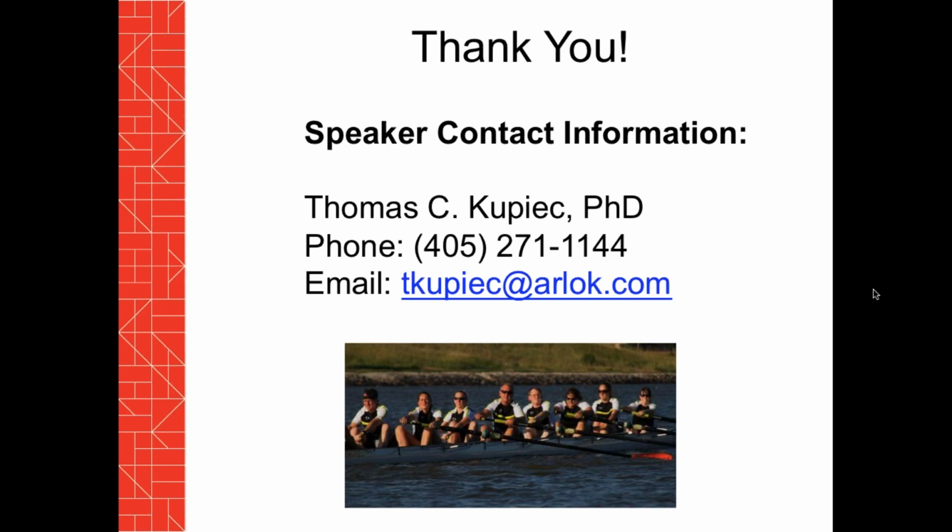Hi, this is Tiffany. For sterility testing, you always want to test your finished product, so it would not be appropriate to take fills from the beginning, middle, and end of your process. You would want to complete all of your fills and take random sampling of the finished product that has been filled into its final article.